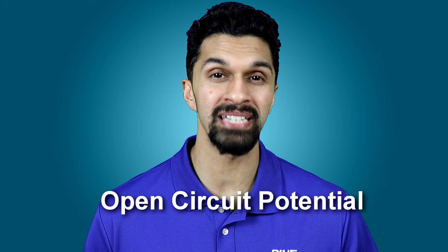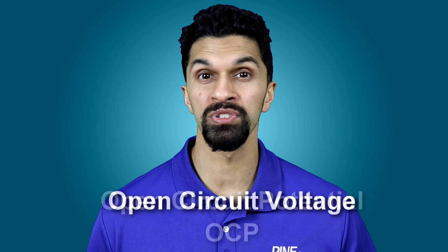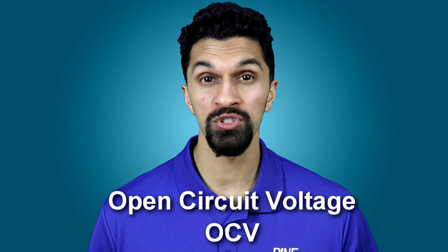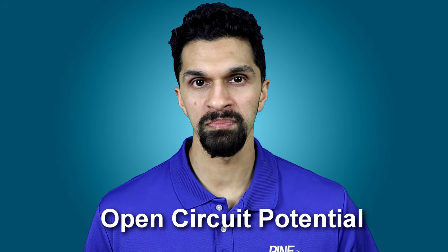Hey folks, in this video we're going to talk about open circuit potential, or OCP, also referred to as open circuit voltage, or OCV, in the context of a 2-electrode configuration. However, in this video we're going to focus on the 3-electrode configuration, which uses the open circuit potential. So I hope you're down with OCP.